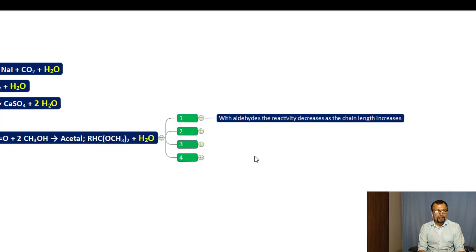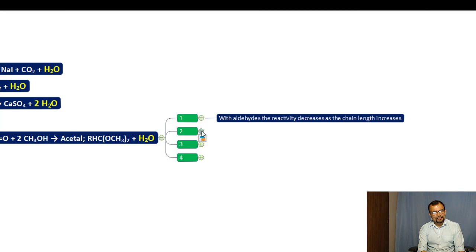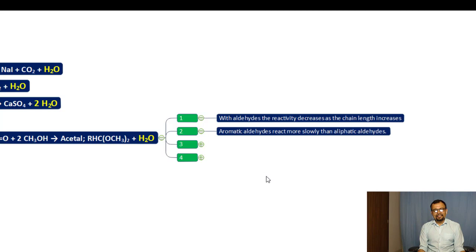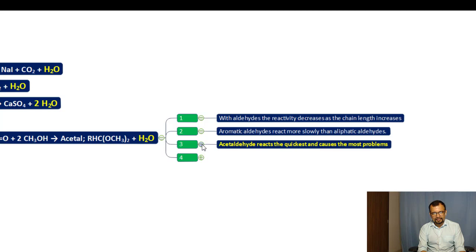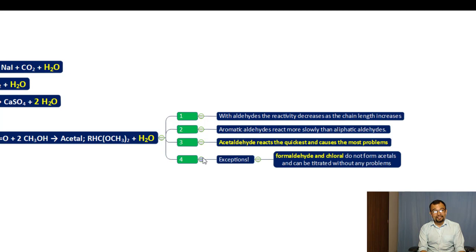With aldehydes, reactivity decreases as the chain length increases. The smaller the carbon chain, the greater the probability of acetal formation and water release. Aromatic aldehydes react more slowly than aliphatic aldehydes. Acetaldehyde reacts the quickest and causes the most problems, being the smallest possible carbon chain — it reacts very quickly and creates water molecules. Hence, the KF reagent is not a suitable technique to estimate water content in acetaldehyde.